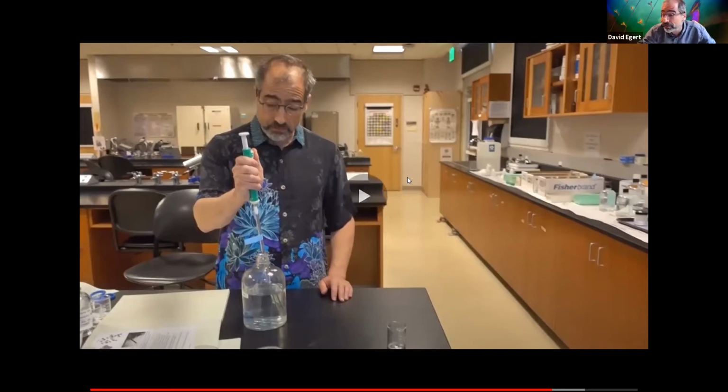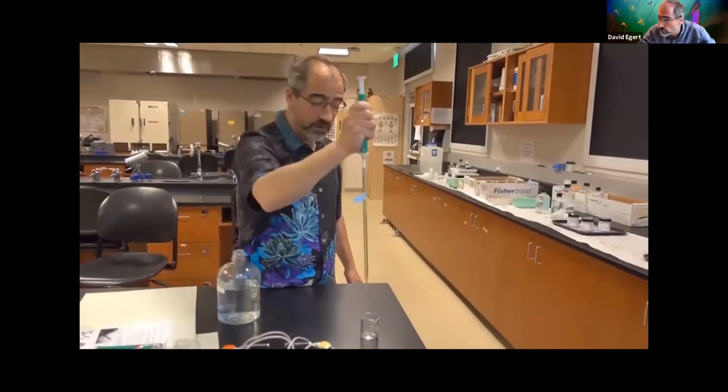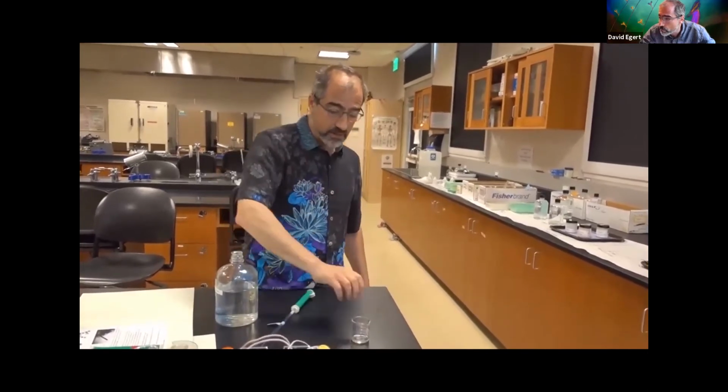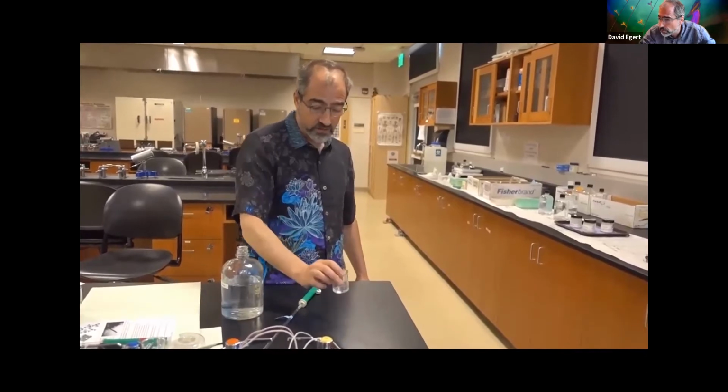Pull up 5 mils of distilled water. I'm going to add the 5 mils of distilled water. Agitate, give it a chance to dissolve if it's going to dissolve.